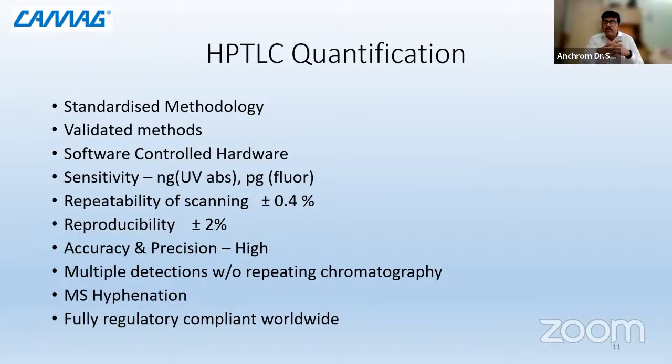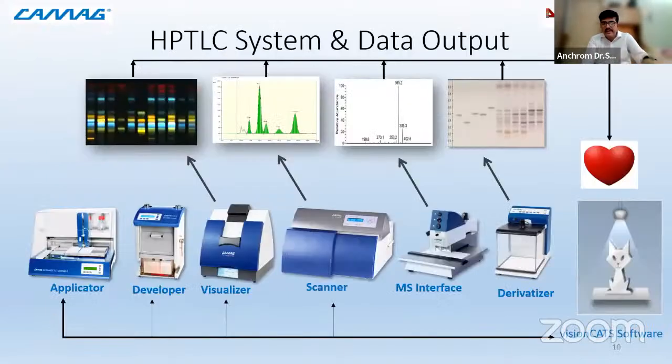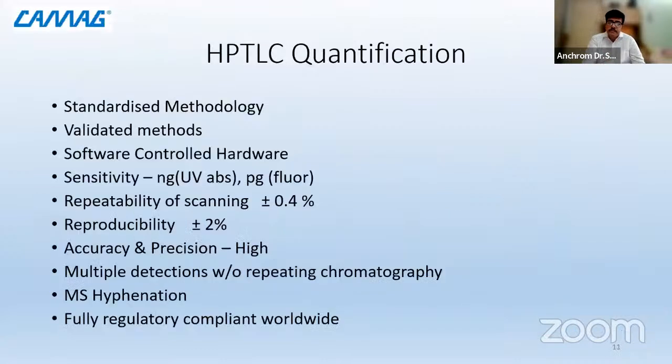And here exactly what we talk about is the sensitivity. Now we have mentioned over here nanogram and picogram. So that is under UV absorbance. The example which I showed you was a fluorescence plate. The earlier example which you see on the top left, that is a fluorescent plate, and the UV absorbance, which is the greenish background because of that activated zinc, induces fluorescence on the plate surface. In that format you can go to nanogram levels. But when I talk about this, people always correlate it to ppm and ppb.